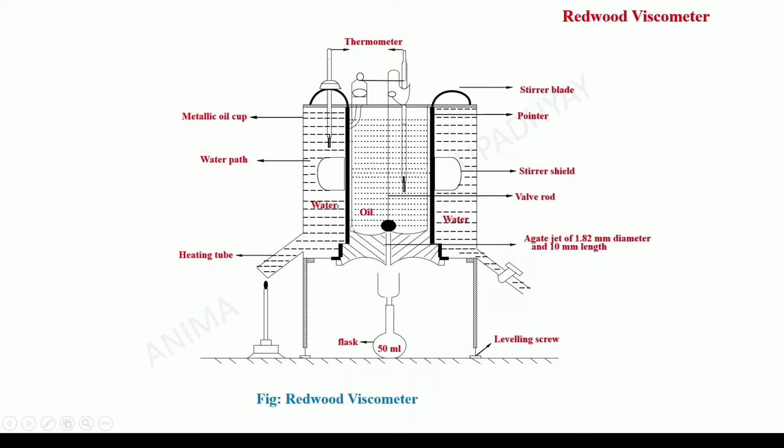For this, we require a brass cup which is around 90 millimeter long and 46 millimeter wide, and the inner wall of the brass cup is lined with silver.